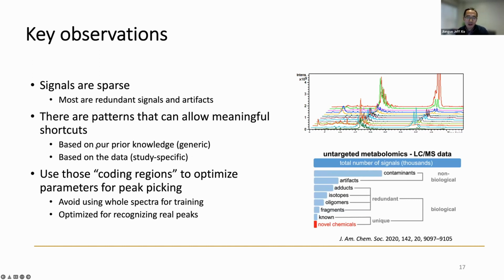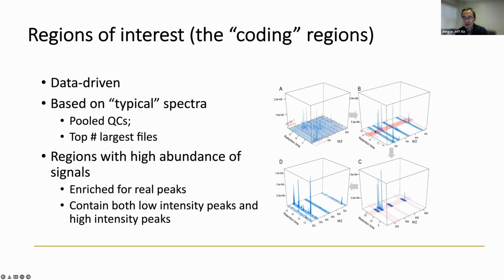And actually in the long term, we can go to the spectrum and find specific m/z values. Based on what we want to ask about the whole pathway, we can tell where to look in these regions and just train on these regions, not use the whole spectrum. There are some issues with that because accessing the spectrum is not that easy, but now we have overcome that. At the beginning, we could not do that accurately, so we chopped the spectra into different bins and found those with the high abundance signals. This is the current implementation, but we know we can do much finer control nowadays.